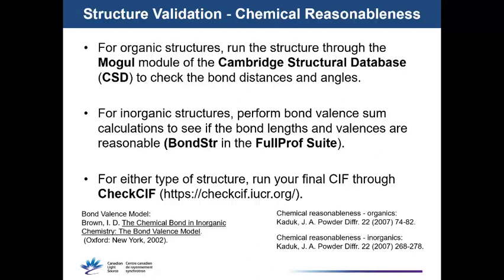For inorganic structures, you can use what's called the bond valence method, and you can see if your bond lengths and your empirically calculated valences are actually reasonable, because obviously you should know what valences you're expecting based on the geometry. And again, for both types of structures, the ultimate comparison can be to perform a DFT optimization and see how close your DFT and your Rietveld refined structures match.